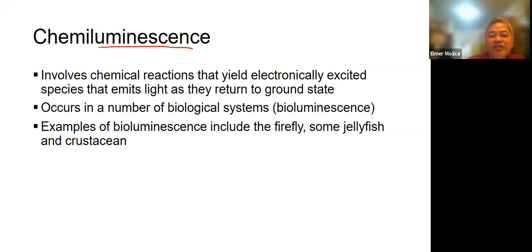But when we're talking about chemiluminescence, what's the difference? Yung letter na yan. So this happens from a chemical reaction. It involves chemical reactions that yield electronically excited species that emit light as they return to the ground state. Okay? So ano yung pagkakaiba nito doon sa luminescence?